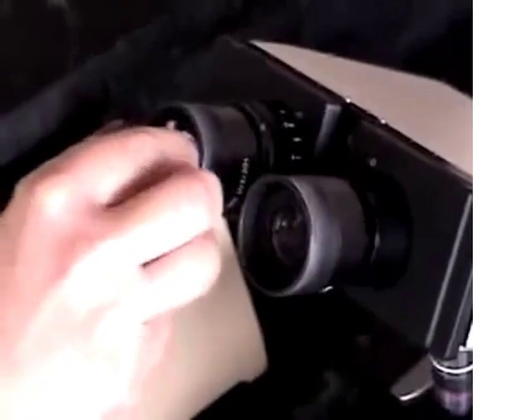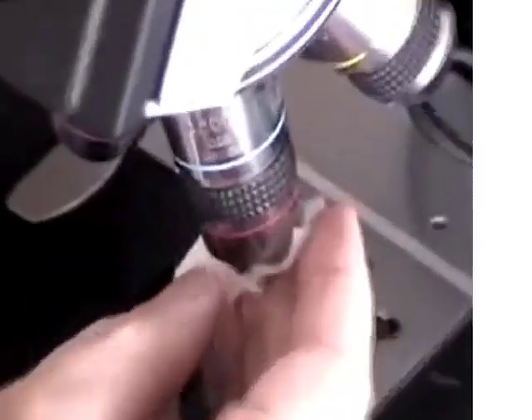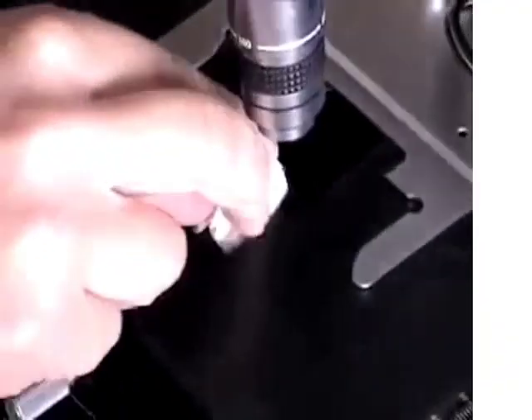Remember to clean both the ocular lenses and the objective lenses. Be sure to use lens paper, and clean the 100x oil immersion lens last in case there's any oil left on that lens.